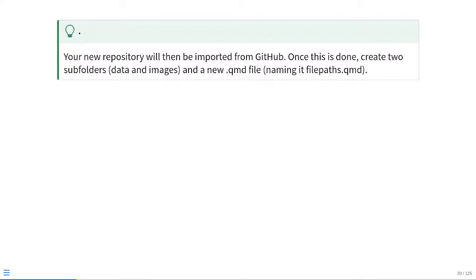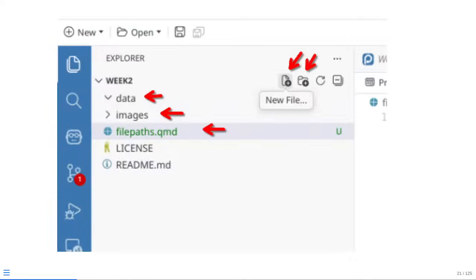and go ahead and hit open. And at that point, what I do for every single project, regardless of what it is, I try to keep some basic infrastructure organized. So if you come into Positron and you look at your left primary sidebar, you see you have this option to create additional folders within that window. So I'll just go ahead and create a couple additional folders. I normally will create a data folder where I'll stick any FCS files that I need for that particular project. I'll create an image folder just in case I'm taking screenshots and I want to document what I'm doing. And I'll just create an initial Quarto Markdown file. In this case, I named it file path using this new file option just so I'm able to start writing code and documenting what I'm doing. And then at that point, we are pretty much ready to go as far as getting the initial parts set up.